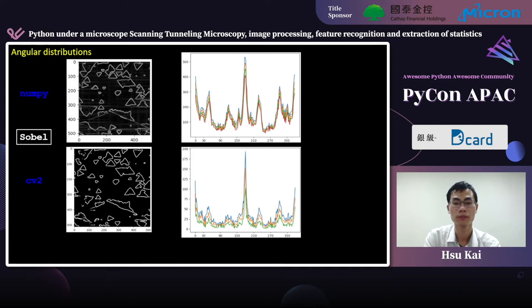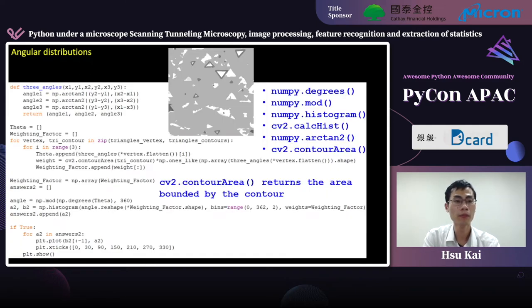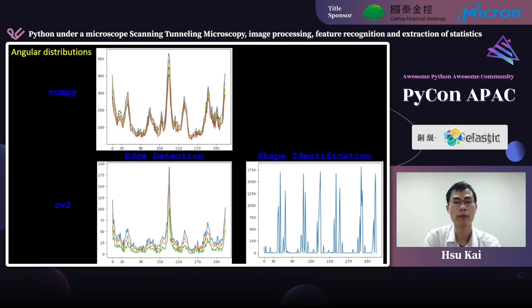And here are the results. As for the shape identification method, I also gave a weighting factor, which is based on the triangular area bounded. And since in reality, intensity also relies on the triangular area. It relies on the island size. Larger islands contribute more intensities than those smaller islands. So, here I use OpenCV contourArea to return this weighting factor for me. And here are all the results. And as you can see, by either using Sobel operator or shape identification method, the peak locations are nearby 0 degree, 60, 120, 180, 240, and 300. And this tells us that the dominant patterns on the image are from 0 degree domain.